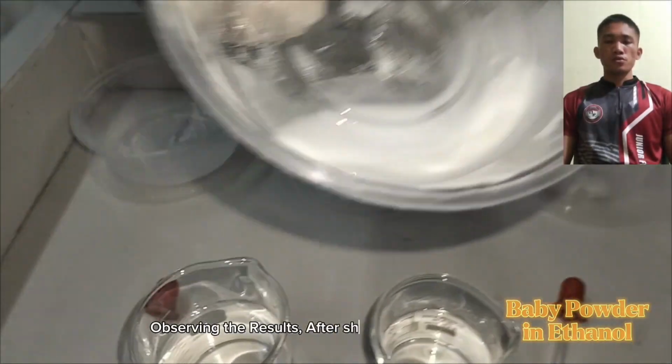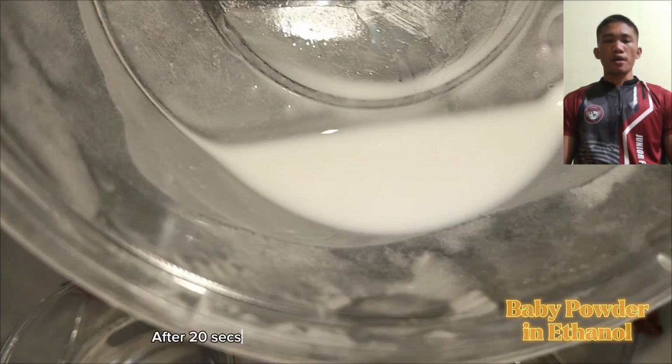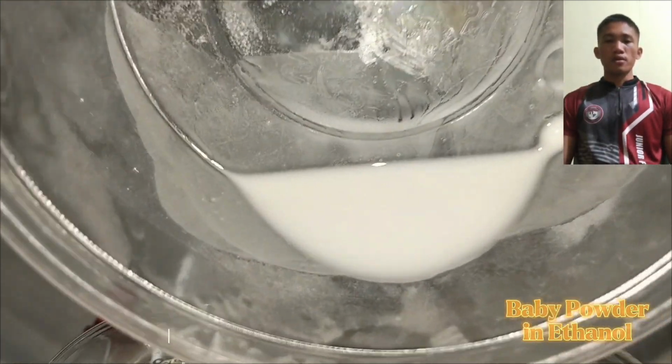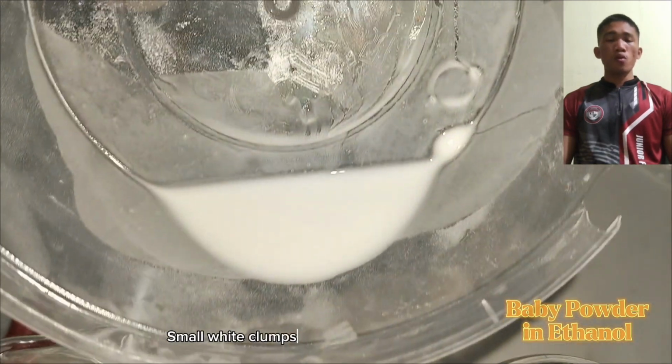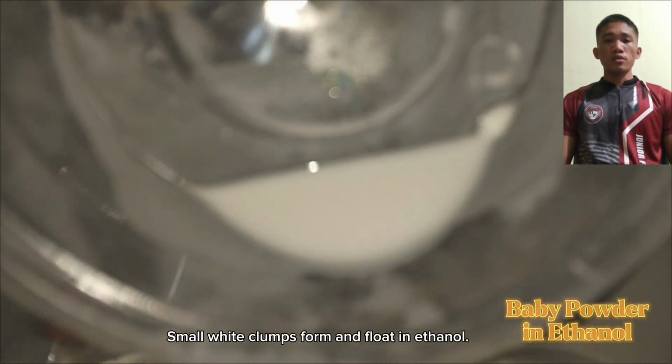Observing the results after shaking 20 seconds. After 20 seconds, the baby powder does not dissolve. There are small white clumps that form and float in the ethanol.